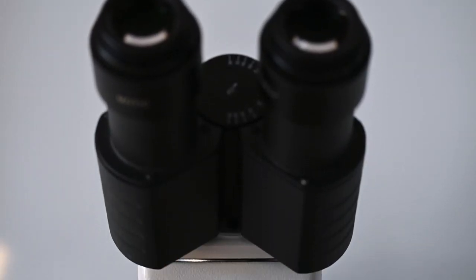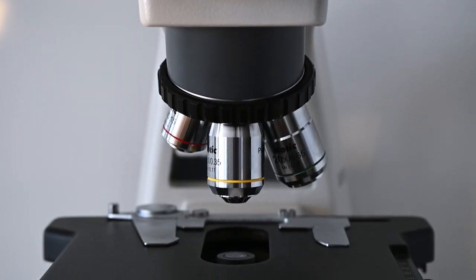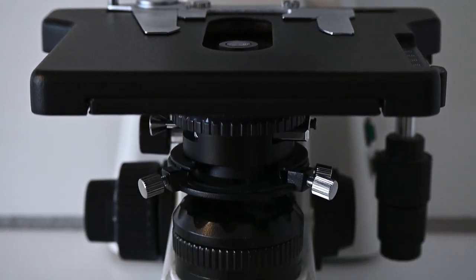This microscope is actually quite popular and used by many talented people to create high quality images and video for both YouTube, Instagram and other social media, and it's also used in professional labs all around the world. And I know that the YouTube channel Journey to the Microcosmos made a lot of their first episodes entirely with a BA-310 microscope.